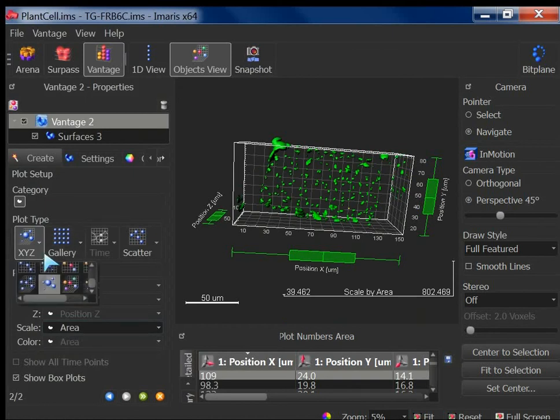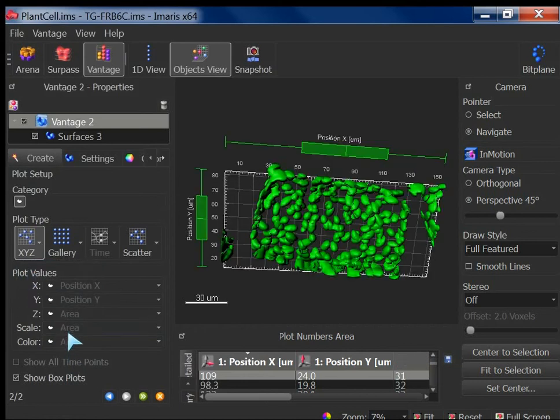Okay, because I have different versions of Imaris, and they keep on changing this option. So now here you can see that when you click individually, then only it is possible to change the different criteria. When you click on the first XYZ, there is nothing you can do here, right? It's just X, Y, and Z with respect to XYZ.